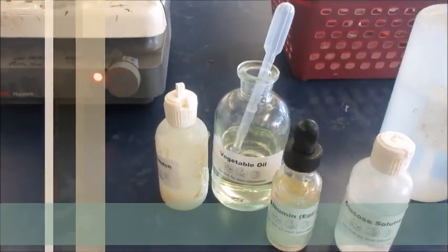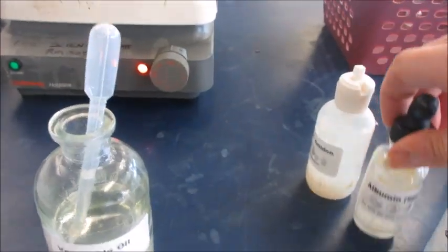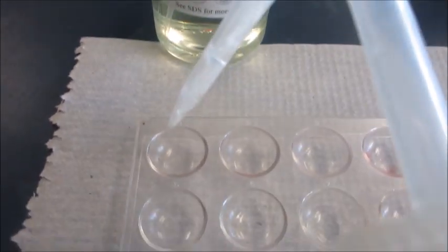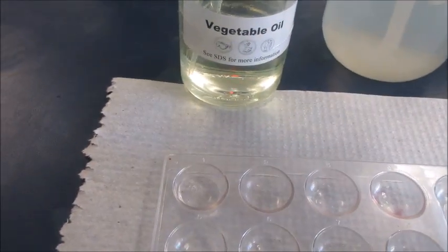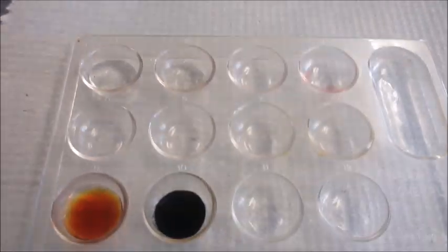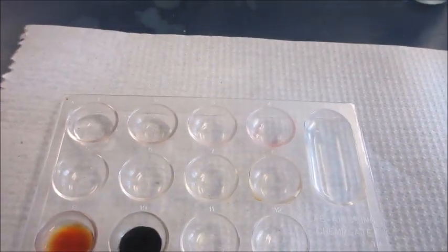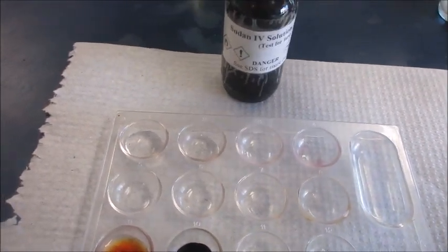For the next test, we will be testing for fat with vegetable oil. But first, we always must start by testing water — the control. Place five drops of distilled water into one well, and then place five drops of vegetable oil into the next. To test for fat, we'll be using the Sudan 4 solution. First we test water, and now we test for the fat.